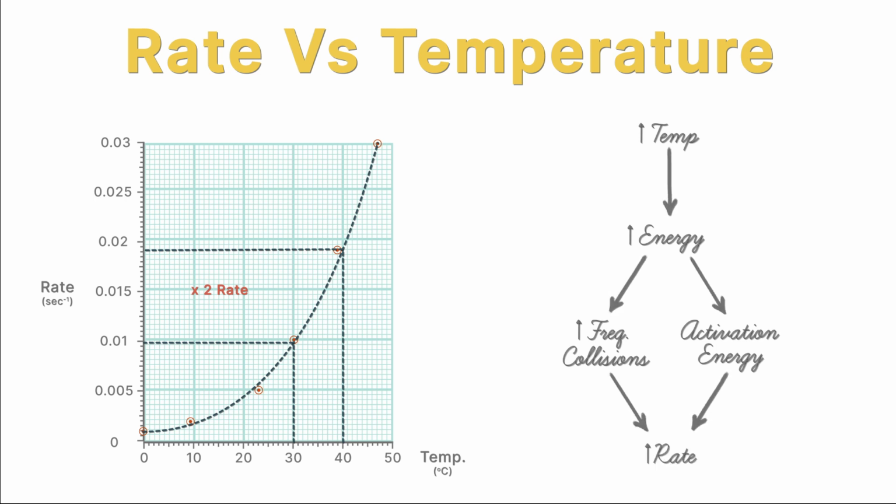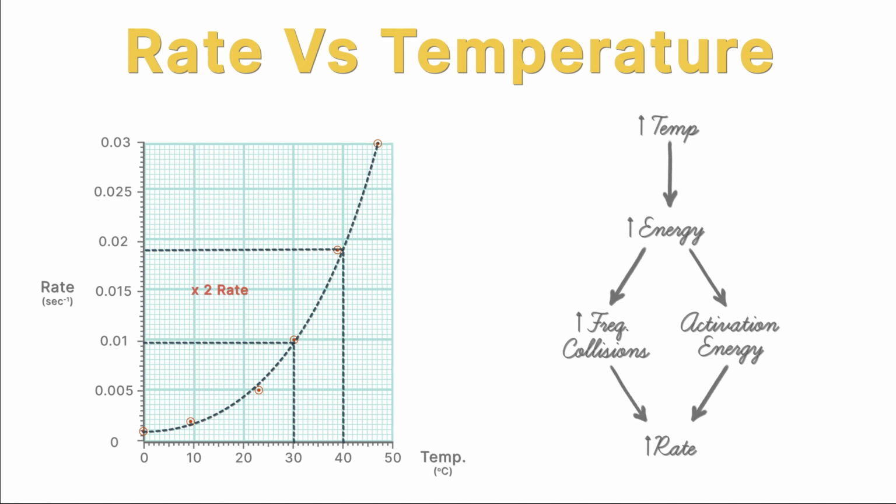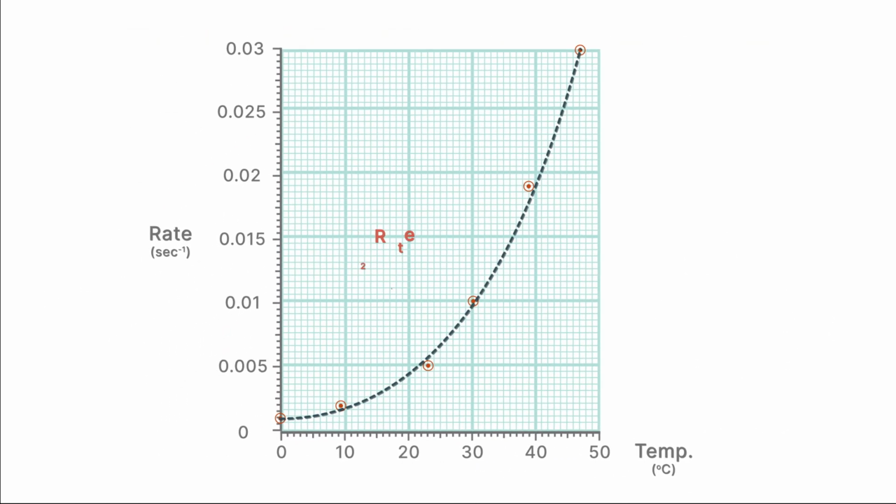Typical questions here will again ask you to predict what the rate will be at a given temperature from the graph. As before, we will simply draw a vertical line from the temperature specified, 35 degrees for example, and find the rate on the y-axis. The time can easily be calculated from the rate, of course, by getting the reciprocal.